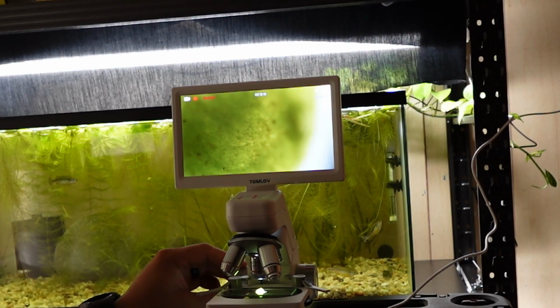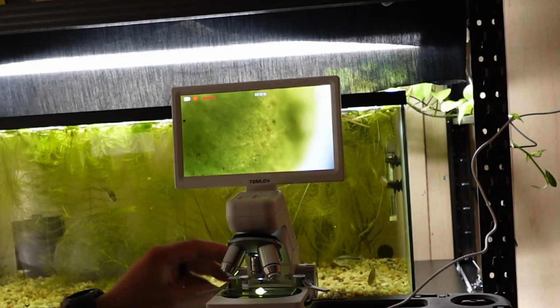Oh guys, I see something in there right there. That's a little piece of detritus or some kind of worm there. Let's see what we have here. Oh guys, look at it. There are a couple things moving. This thing's kind of hairy, kind of giving away what it is. Let's look at the very top. You can kind of see it textured a little bit. It's green. Can you guess what this is?